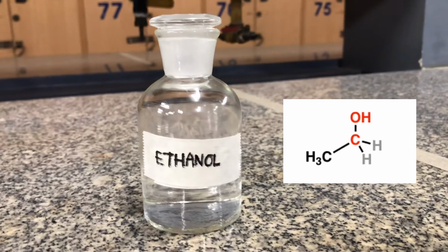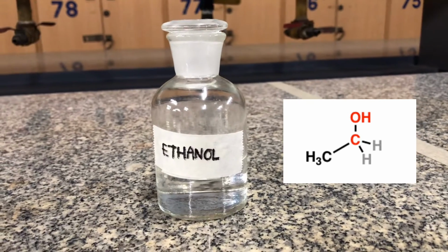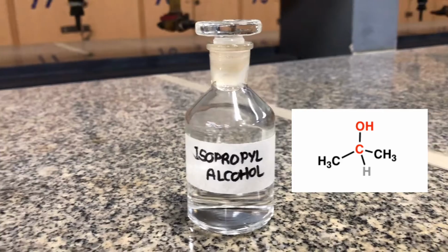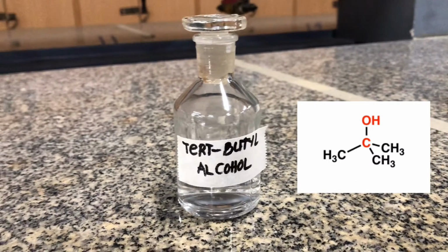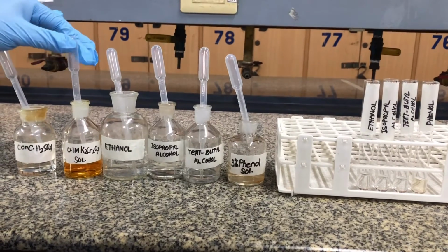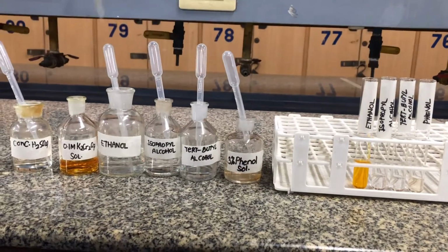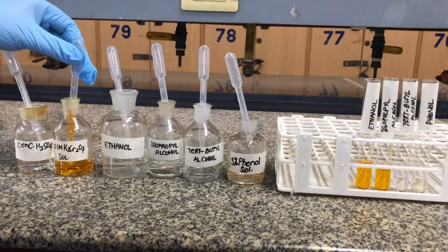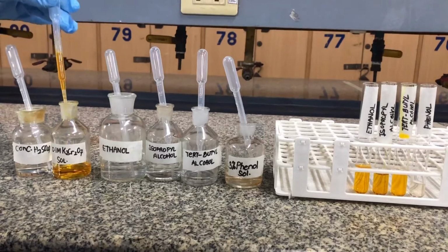The representative alcohols used for this experiment are ethanol as primary alcohol, isopropyl alcohol as secondary alcohol, and tert-butyl alcohol as tertiary alcohol. The Bordwell-Wellman test is conducted by adding 1 ml of potassium dichromate solution into each test tube containing already 1 ml of each of the representative alcohols. The test is also conducted in a 1 ml phenol solution.